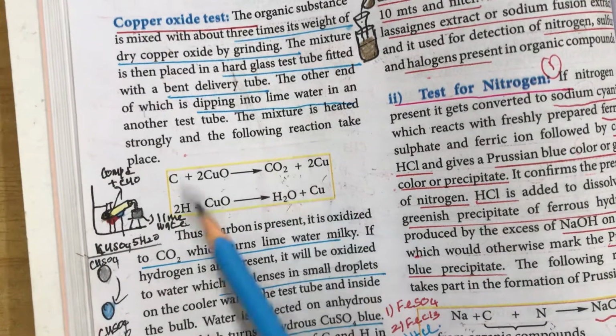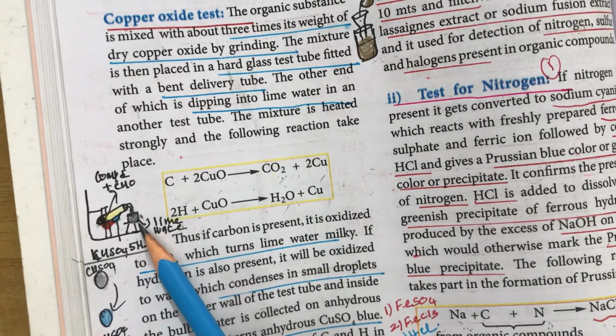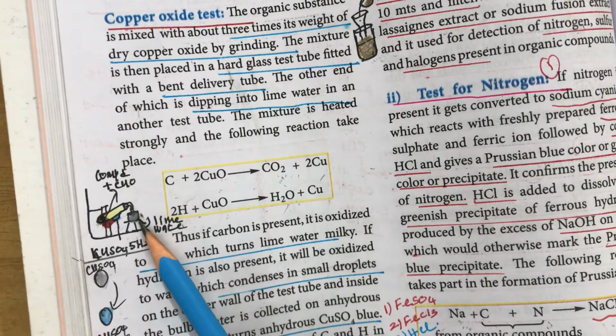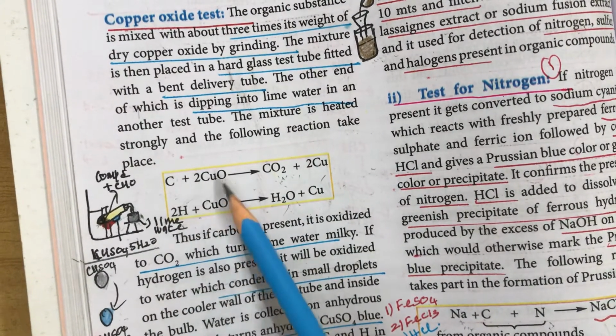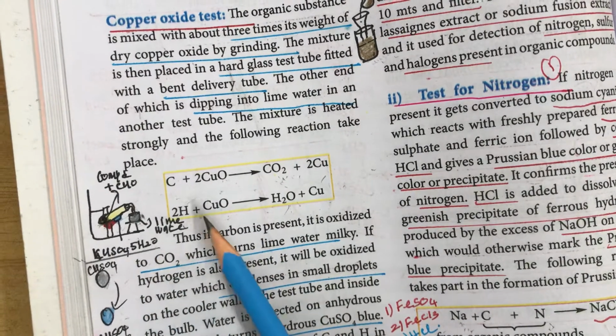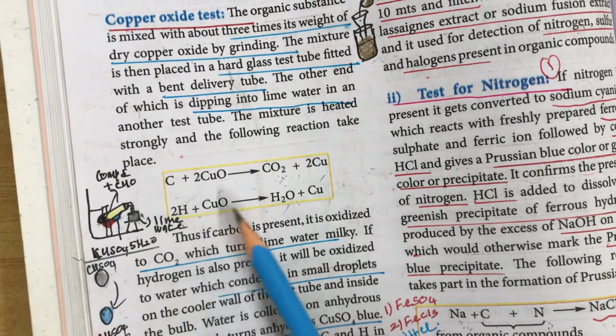The evolving carbon dioxide reaches the lime water and turns lime water milky. The lime water turning milky shows the presence of carbon dioxide, and hence carbon, in the organic compound. Similarly, the hydrogen present in the organic compound gives water vapor, which condenses into water.